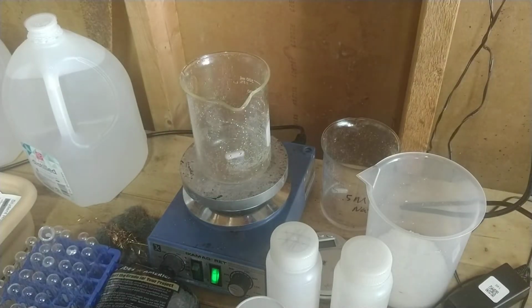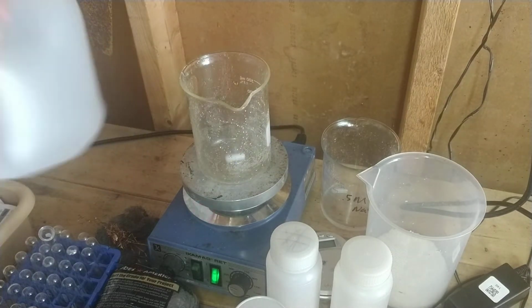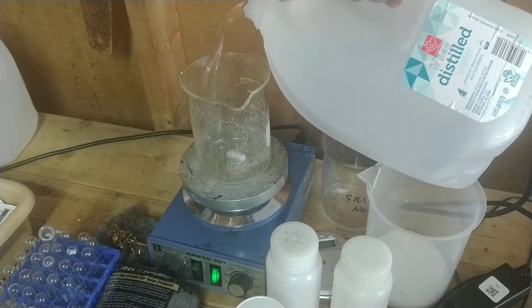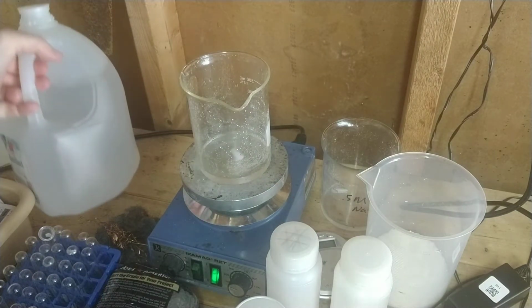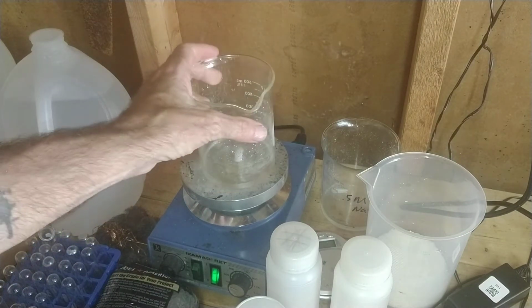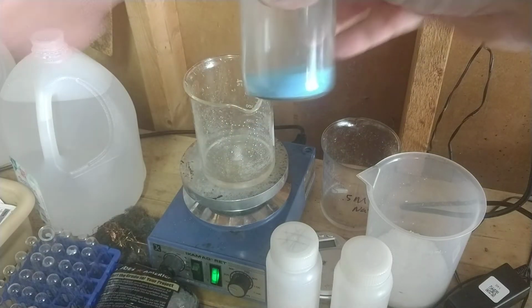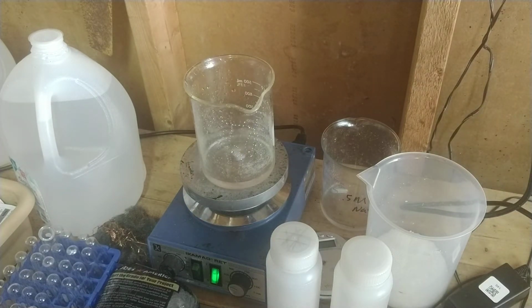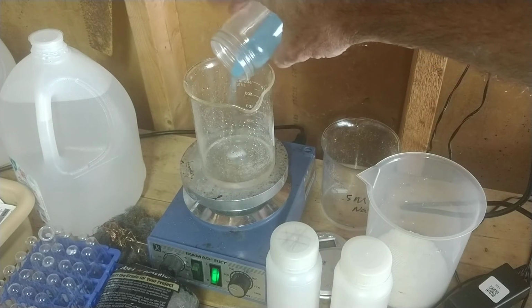Now, I told you I would prove those were soluble, right? So here we go. We're back at the mixer. We'll put a little water in here. And I've already shown you that sodium chloride was soluble. So I've got some water here. Let me put some copper 2 sulfate in there. If you look right here, I've got some copper 2 sulfate. Everybody's got that in their dirt bike shed, right? Nope. Probably just me. Put a little copper 2 sulfate in there.